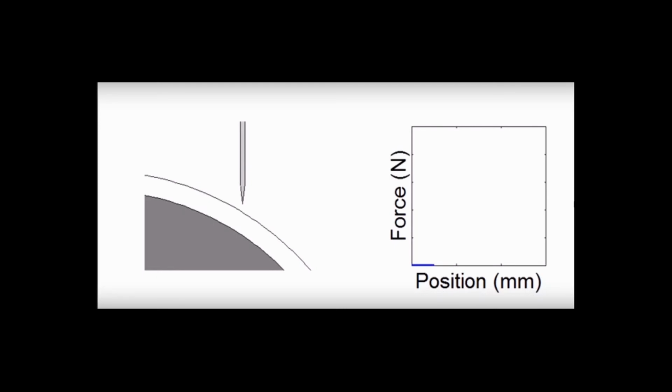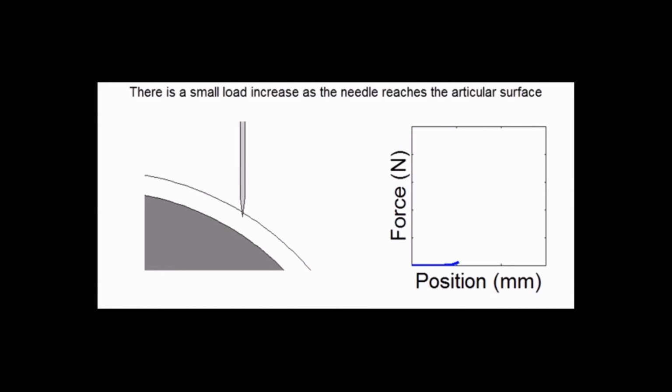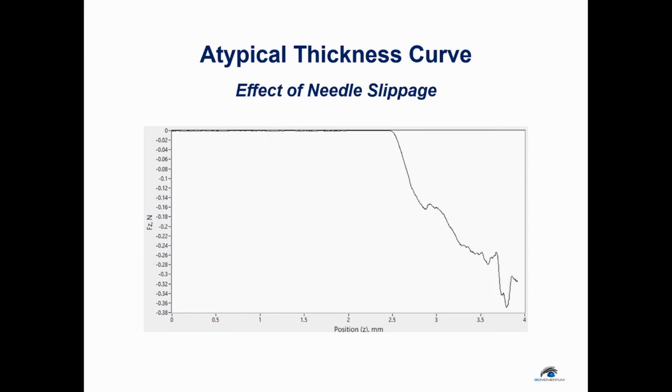The vertical force is also recorded when the needle returns to its original position. In these examples, this corresponds to the region defined by a rapid decrease in force, that is, towards 0 newtons.